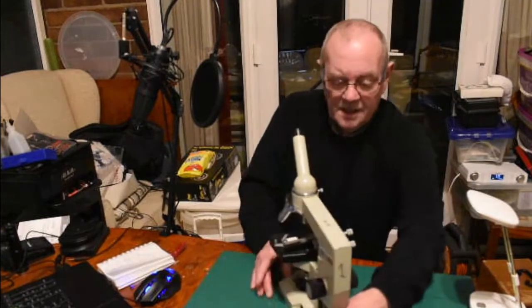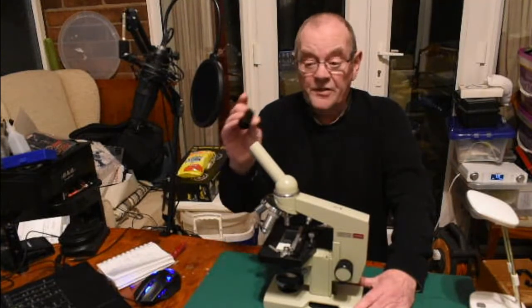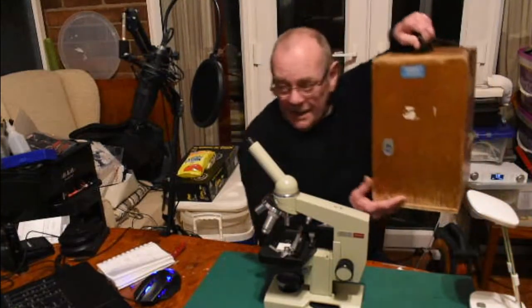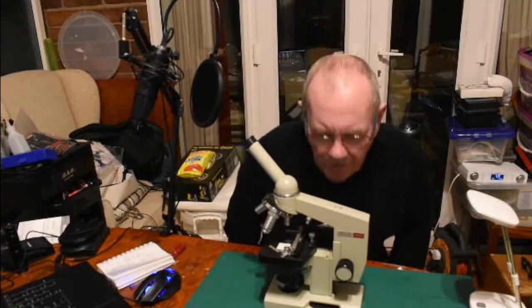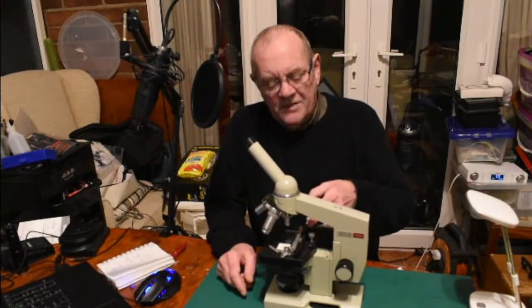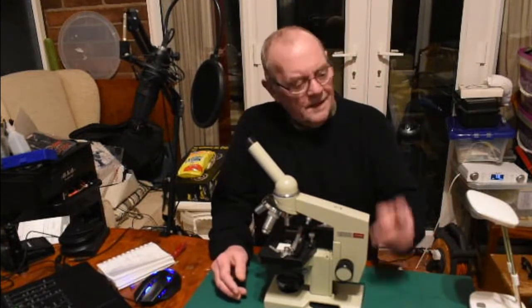So: mechanical stage, extremely good optics, and it came with two ocular lenses — a 15x and a 10x. It's a brilliant machine. If you're lucky it might come with its original Soviet Union USSR box with a key to keep prying hands away. What did I pay? 70 pounds. And the seller managed to find me a proper USSR mechanical stage for this microscope as well — so I'm very happy.